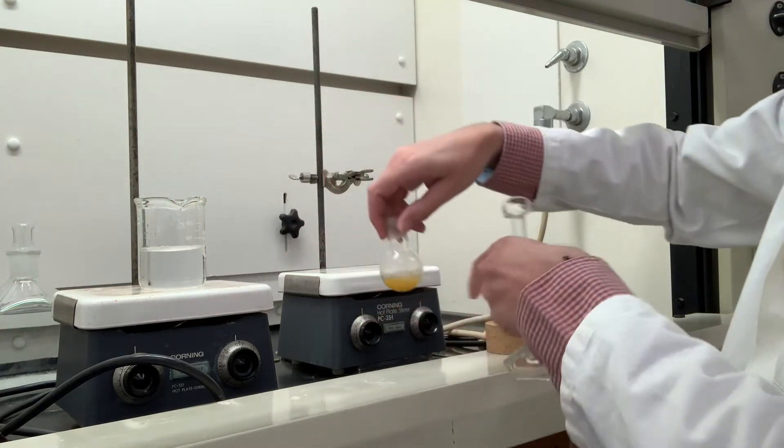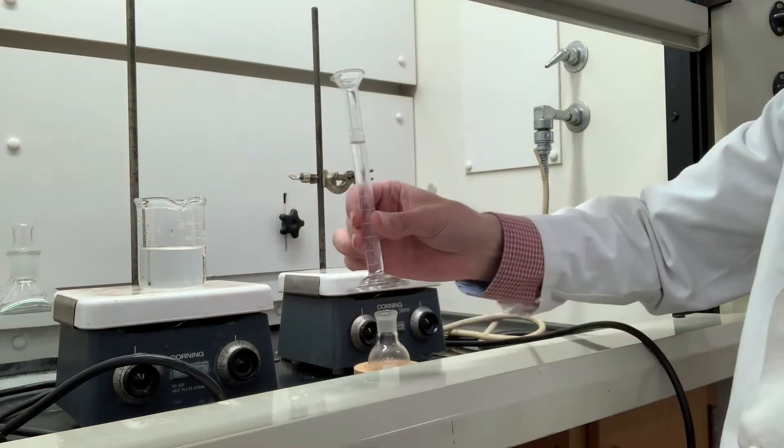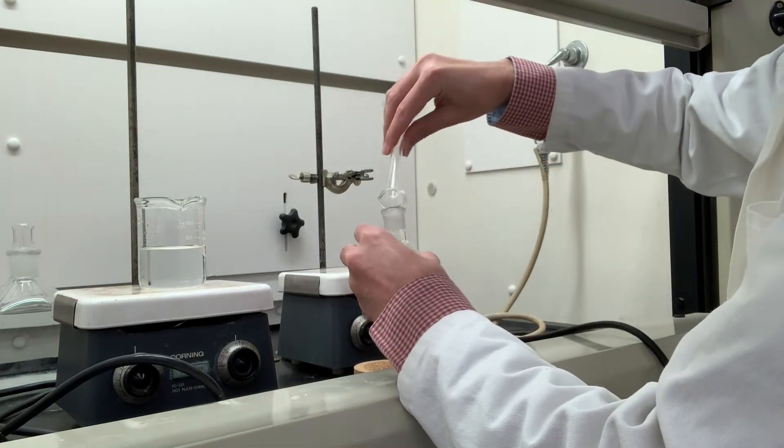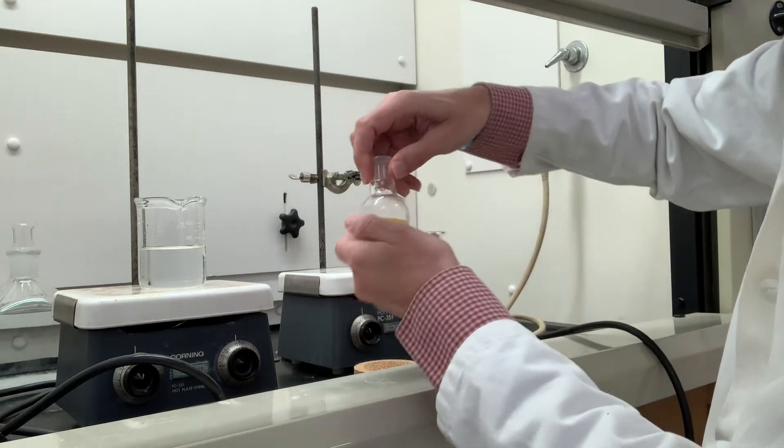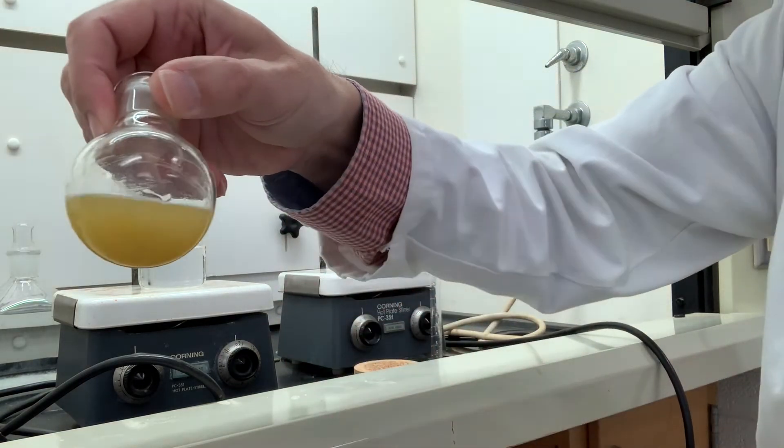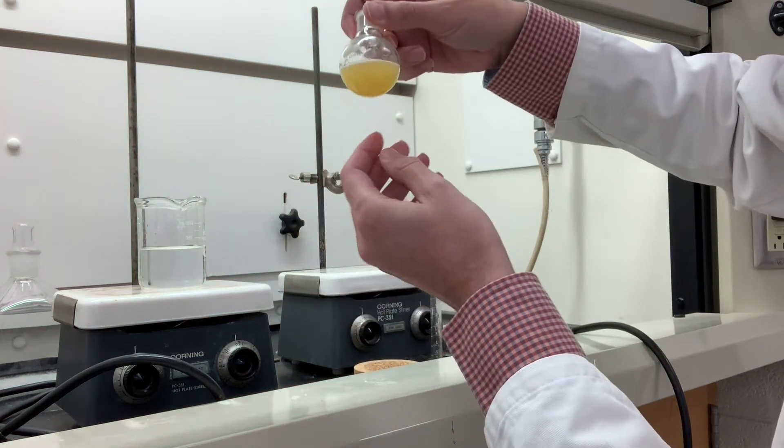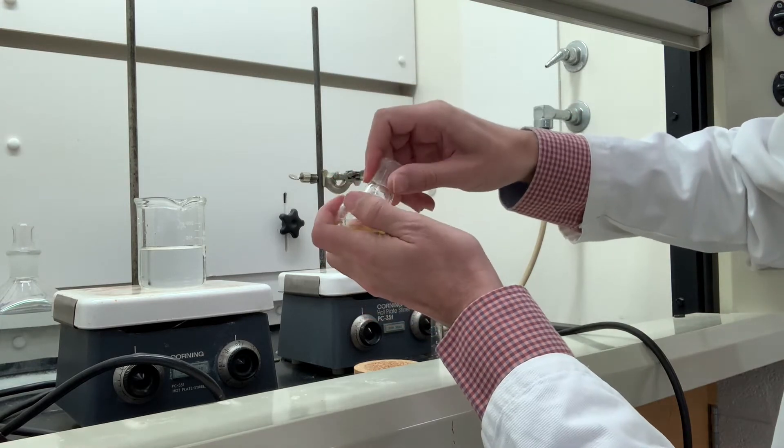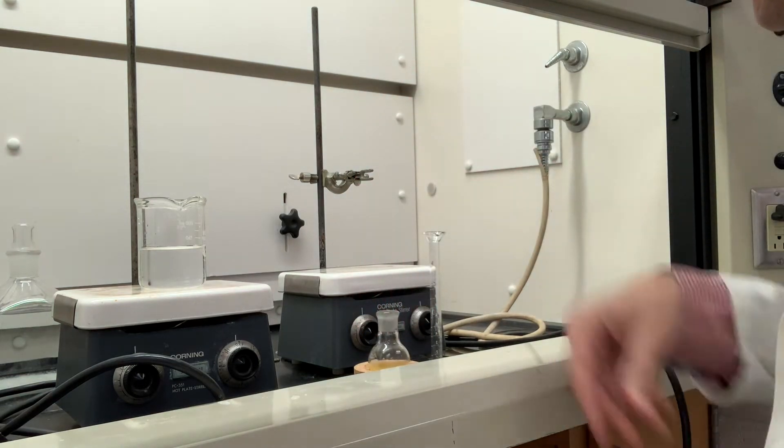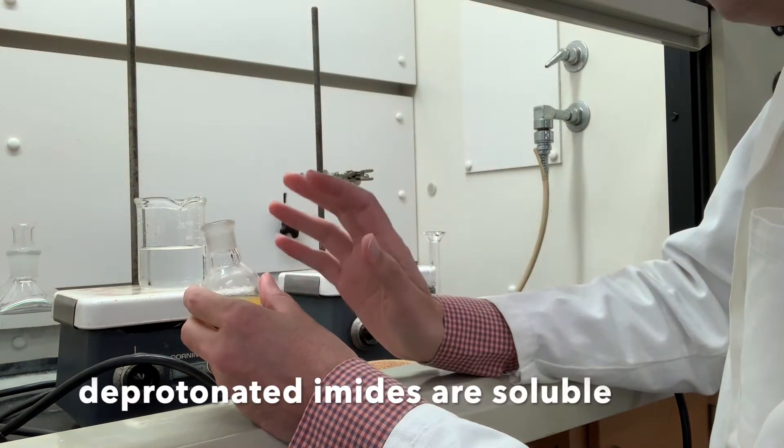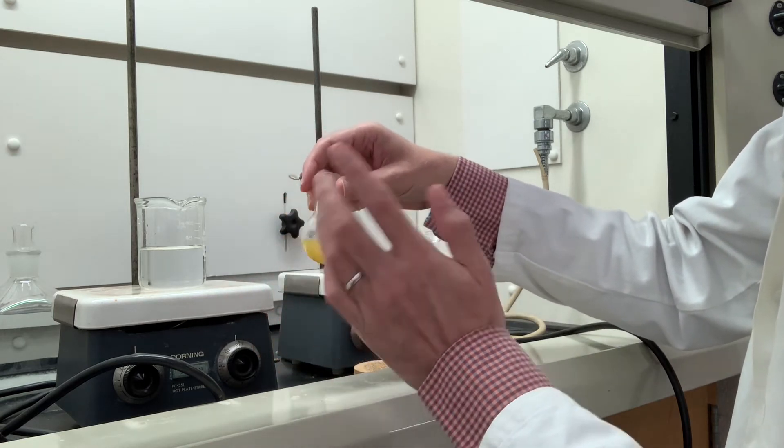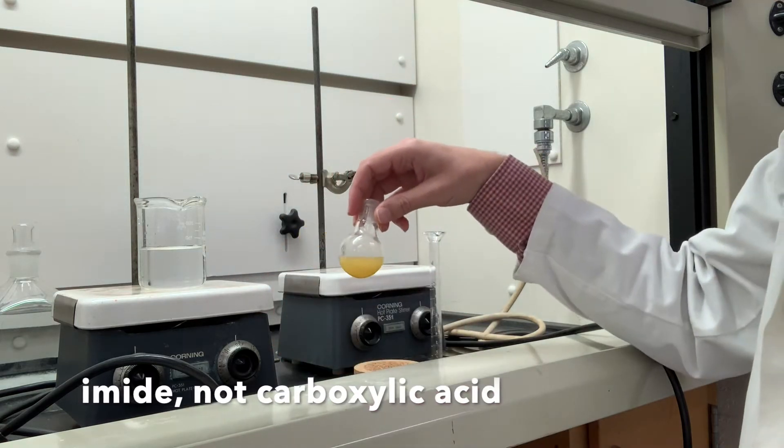Now that the reaction mixture is room temperature, we want to add 10 milliliters of distilled water. It's kind of cloudy with very small amounts of solid. Normally the procedure says to gravity filter the solids out. The product here is a carboxylate - the carboxylic acid is deprotonated in this very strongly basic sodium hydroxide reaction mixture, so any solid here is not the carboxylic acid, it's a byproduct. I'm going to set that up.